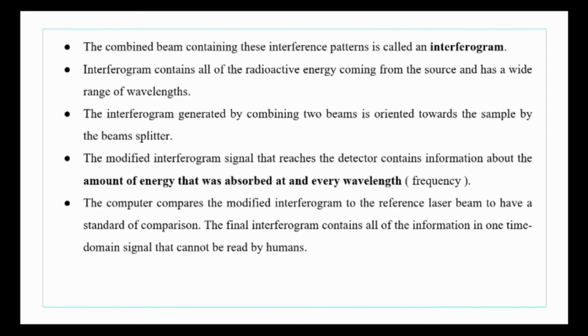The interferogram contains information in one time domain signal, means in a type of signal or symbol which a human cannot read. So how can we extract that information?